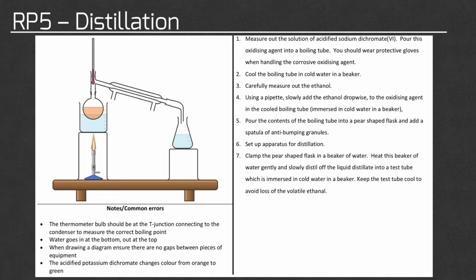The acidified potassium dichromate will undergo a colour change from orange to green. You could be asked about this colour change in the exam.